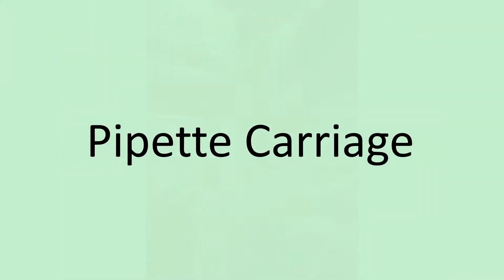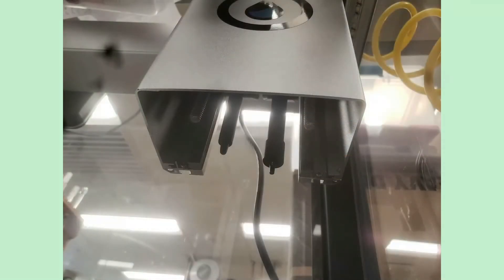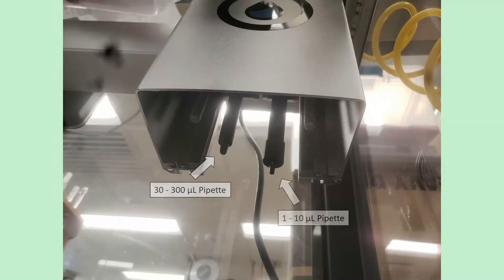We'll start with the pipette carriage — this big box — where everything happens. It holds the pipettes. Underneath you can see two things that stick down: those are the two pipettes. This one is a 30 to 300 microliter pipette, meaning you can aspirate liquids from 30 to 300 microliters. Next to it is a 1 to 10 microliter pipette.